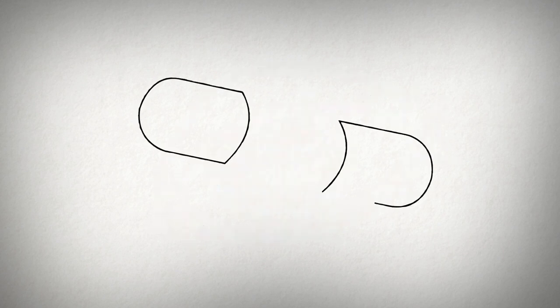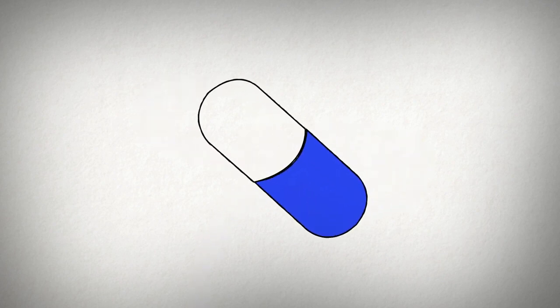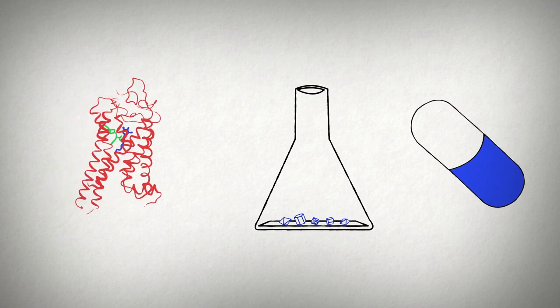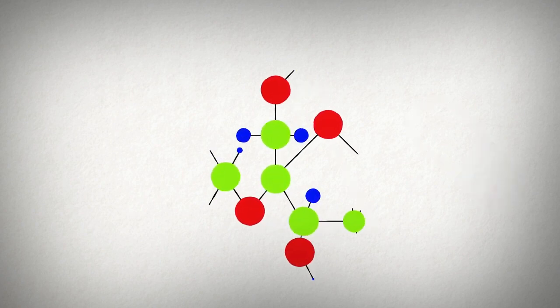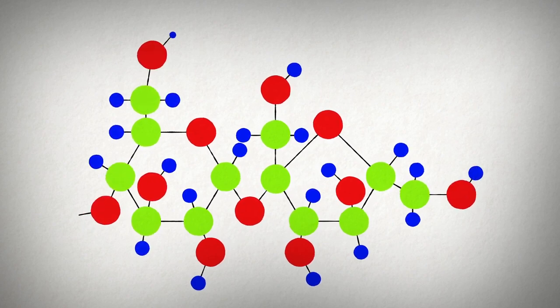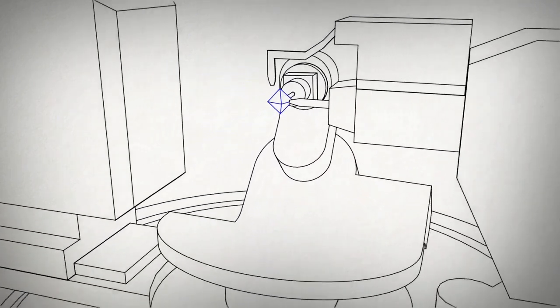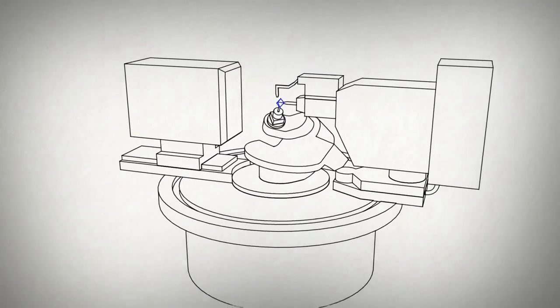Similarly, the detailed knowledge of protein structures is essential to develop new, life-saving pharmaceuticals. Single crystal X-ray diffraction provides important information to finally understand the interaction of new drug candidates with the proteins in our body. As scientists push their ability to engineer materials on the atomic level, single crystal X-ray diffraction becomes an increasingly important tool in their toolbox. Advances in equipment design have made single crystal X-ray diffraction easier to use and more powerful than ever.